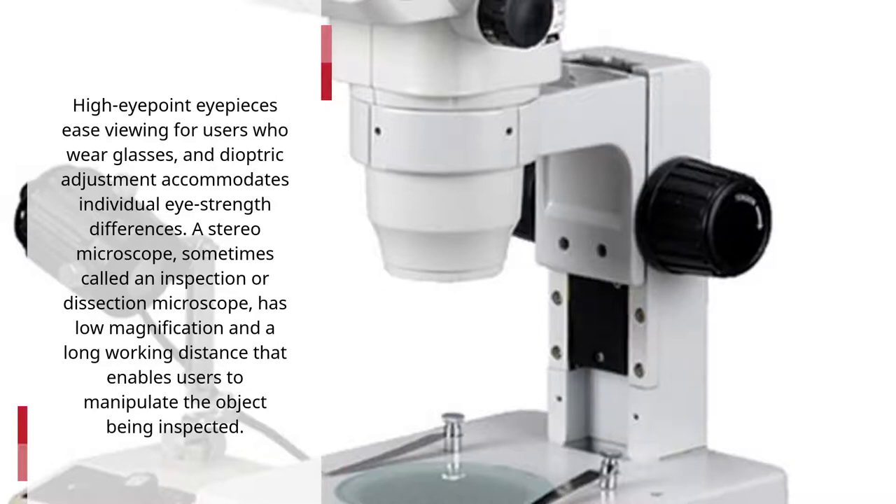A stereo microscope, sometimes called an inspection or dissection microscope, has low magnification and a long working distance that enables users to manipulate the object being inspected.